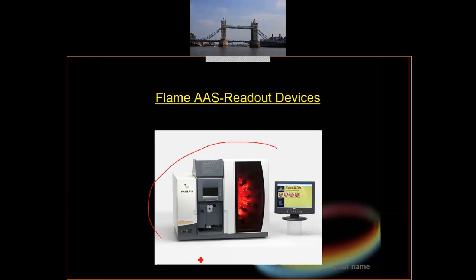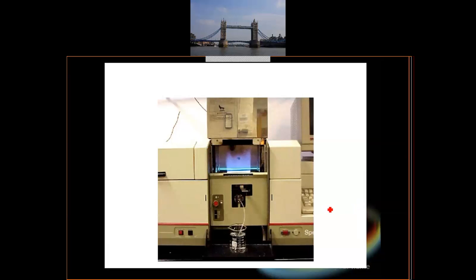Okay, this is quite a new modern AAS, very modern AAS. You can see the light source there. But the one that we have is not like this. The one that we have is similar to this one. Okay, this is an old machine. This is older than me.